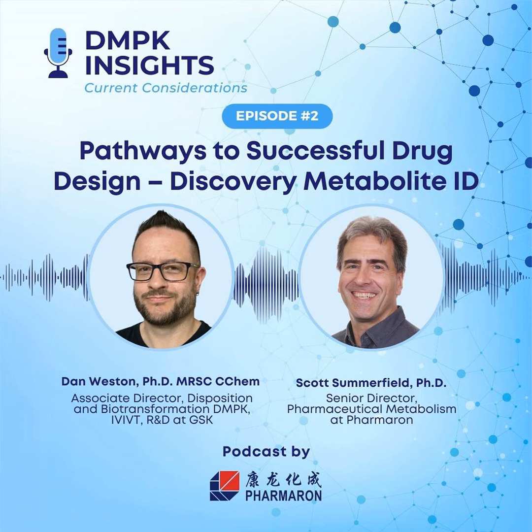I mean, within GSK, but also in the community, about how do you get the most relevant, let's say, qual type workflow, it's referred to. So you get a quantitative clearance measurement of disappearance of parent, but also how do you get the most relevant look at metabolite profiles, or what's happening to drive that clearance where you've got disconnects, let's say.